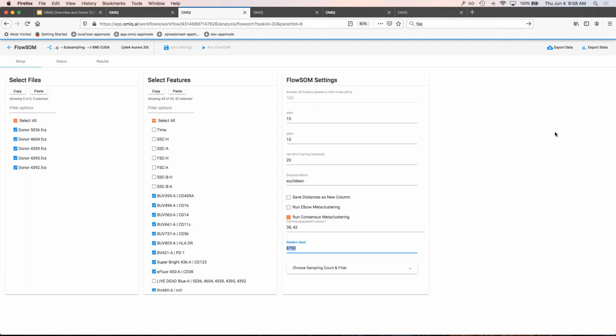If I want to get OMIQ on my system, what are the system requirements that I need to consider? There's basically none. Because OMIQ is a web platform, all you really need is a basic computer. You can even hack it with a tablet or a phone. All you need is a web-enabled device. And beyond that, it's all sort of nice to have, I guess. It's not going to make much difference.